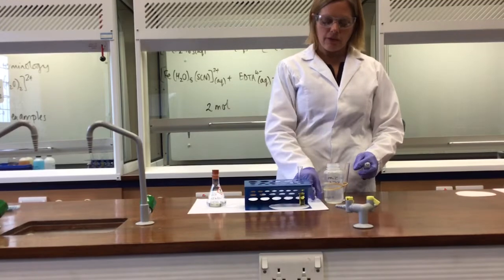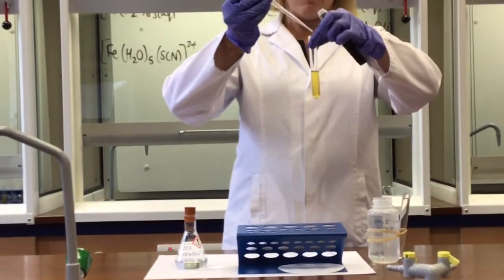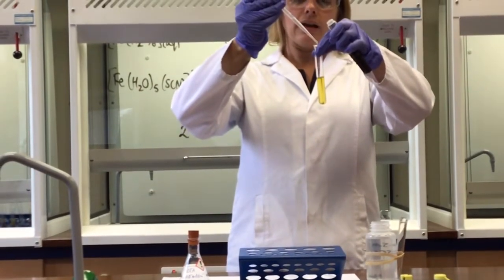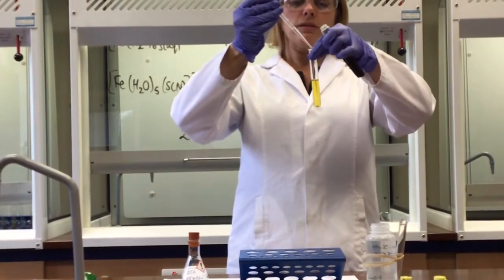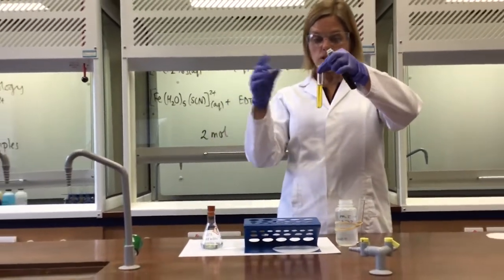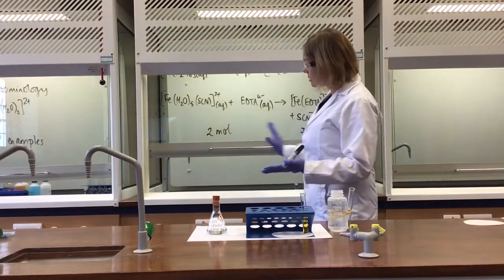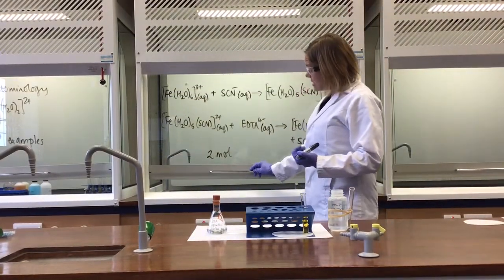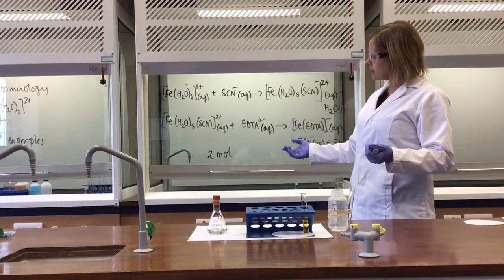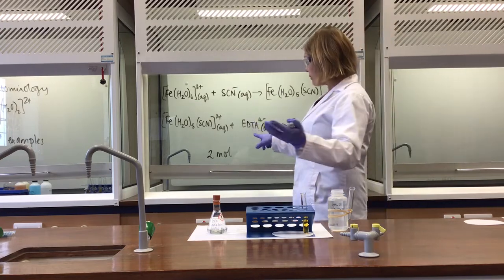So much so that if I take a few more drops of this KSCN, remember 1 drop of it last time turned it completely blood red, I can keep adding it and adding it, and there's no sign of it going back, okay? So there's no sign of that ligand substitution reversing because that would be entropically costly. So EDTA, one example of a multidentate ligand, forms 6 different coordinate bonds with that central metal ion.